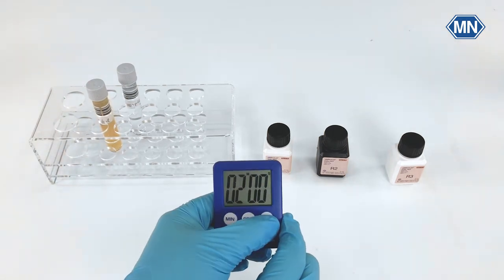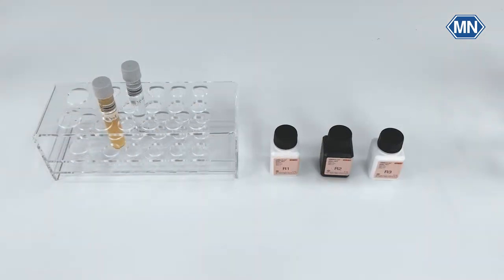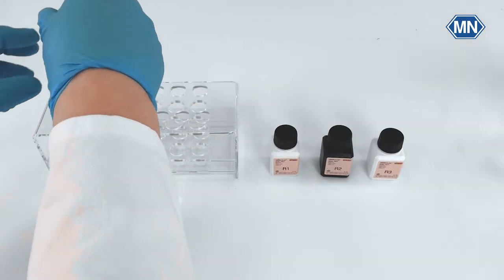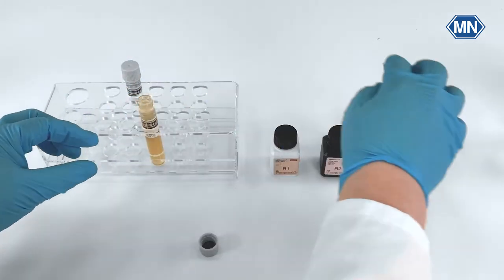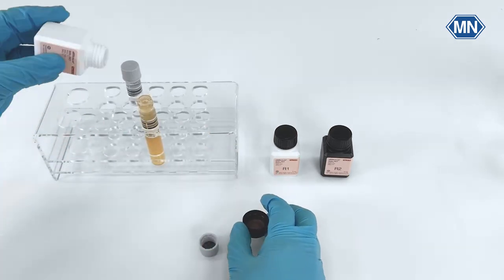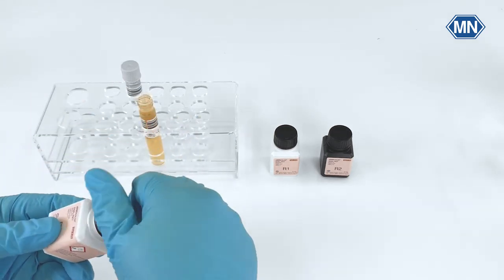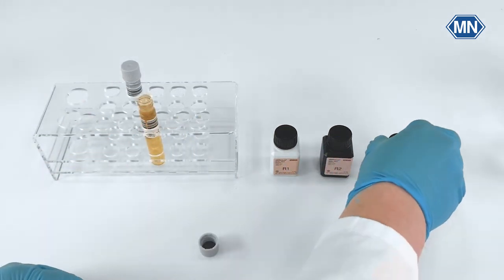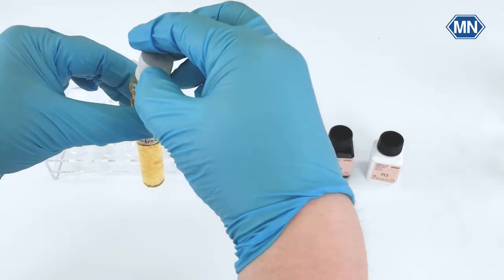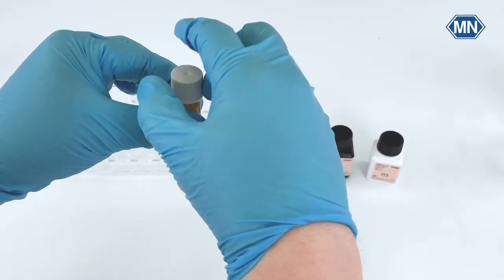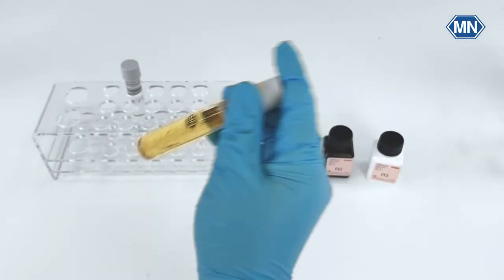Now wait two minutes. After exactly two minutes open the test tube again and add five drops of R3. Flakes will form now. Close without letting any air bubbles in. Shake the tube until all flakes are dissolved.